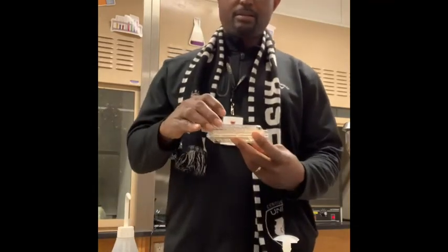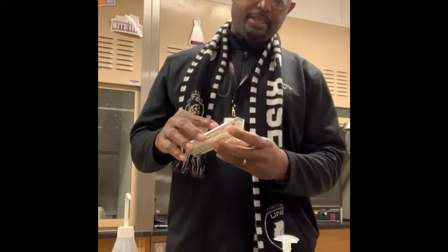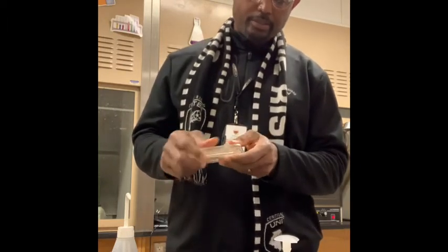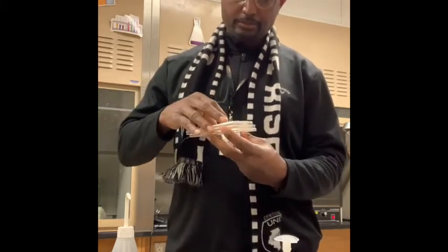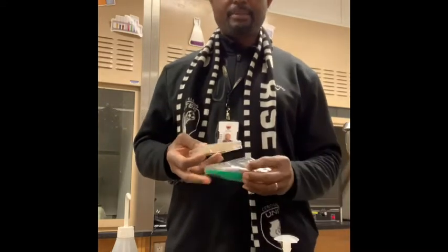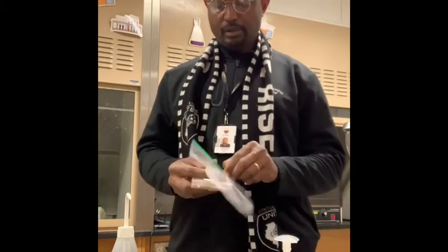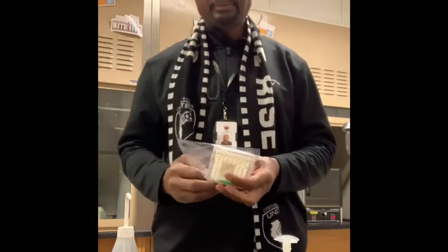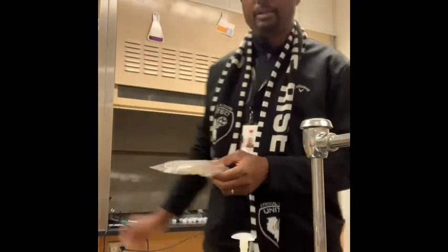We put the lid back on our testing media and make sure it's tightly placed, matches up. And we put it in a Ziploc bag. And then we place it in an incubator for 24 hours. So the incubator is over here in our fume hood.